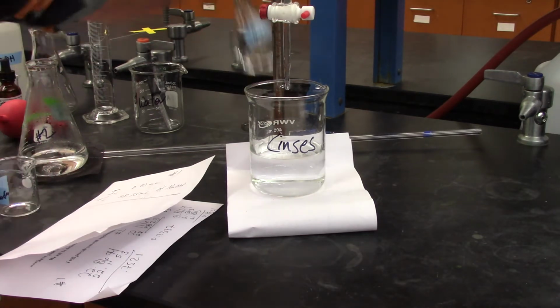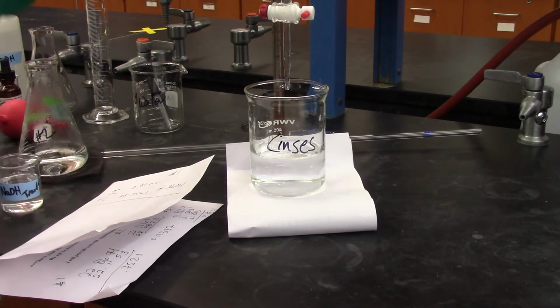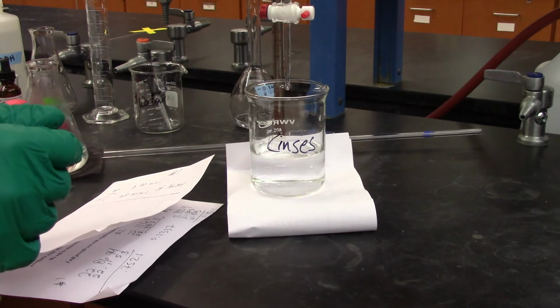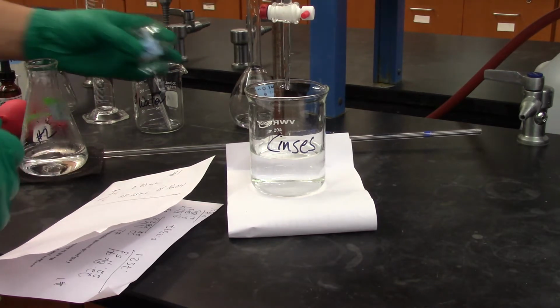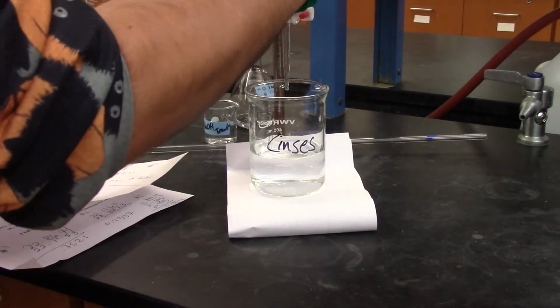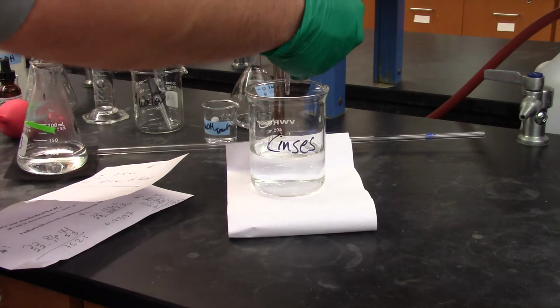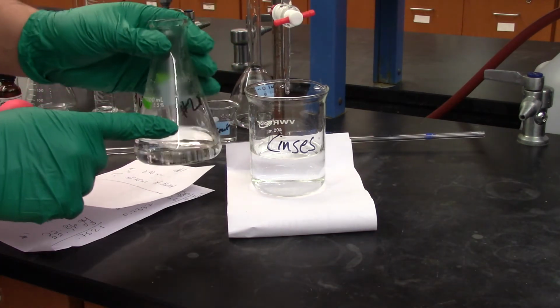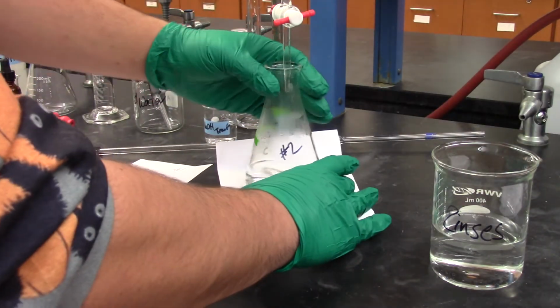And a little more. Again, always transfer into this smaller beaker here. It says NaOH transfer. That's what you want to use when you're refilling your burette. Okay, I'm at 0, and I'm ready to titrate. So this is my flask 2. I'm ready to go.